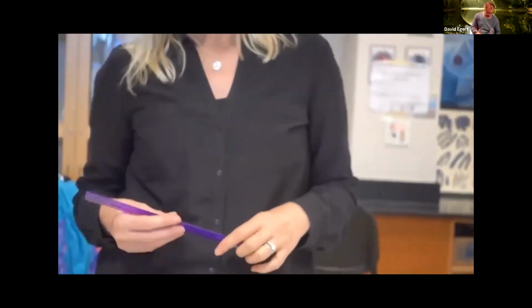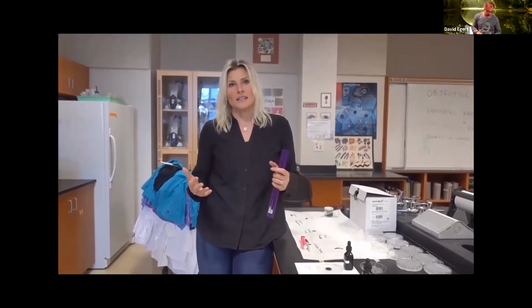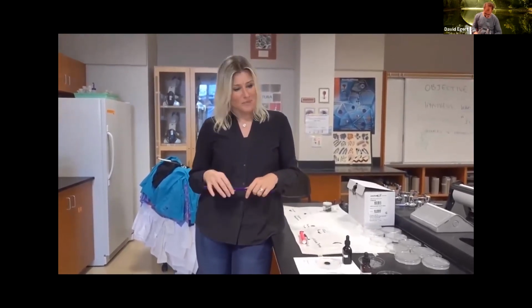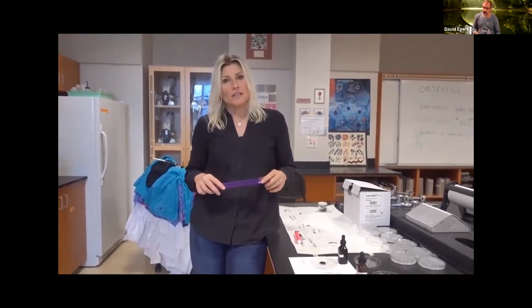And so I also want to mention that we're using agar because if we were to put it into water, you would have convection forces mixing the dye around, and agar is a stationary molecular structure. So we're not going to get any convection messing with our experiment. All right, so we're going to let this sit for another half hour and get our final reading after 1.5 hours.